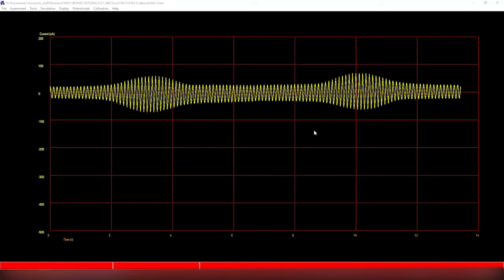And for all the optimizations, there is a whole range of functions available, such as using the current or harmonics to analyze it. When experimentally fitting it as well, you're probably going to need to fit the double layer capacitance, or the capacitance that happens outside of a Faradaic region, for analysis.